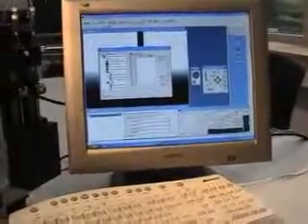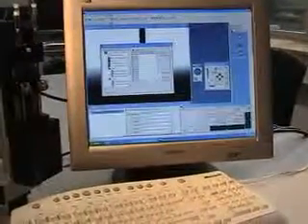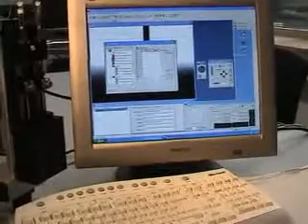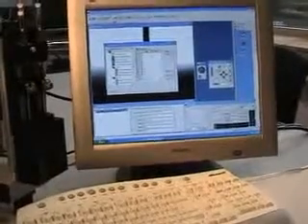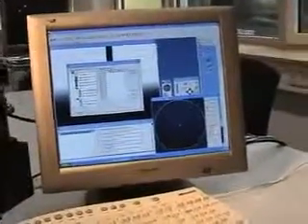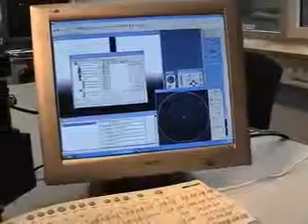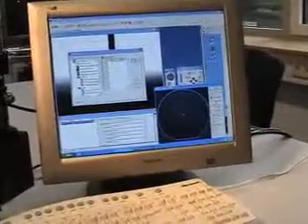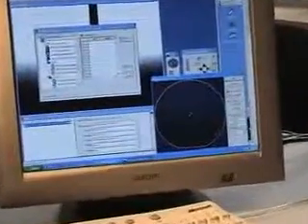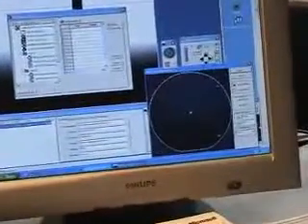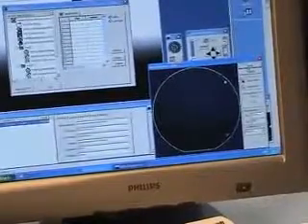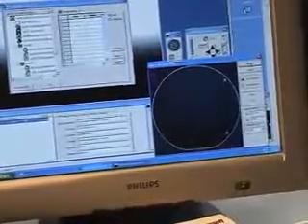Now we are going to define the different dosing positions on the wafer. Here we have a short look on the polar mapping for the wafer, and now we can easily assign different positions on this wafer, even test this position and directly take over the position. Now we have completed the coordinate system, the measuring points.